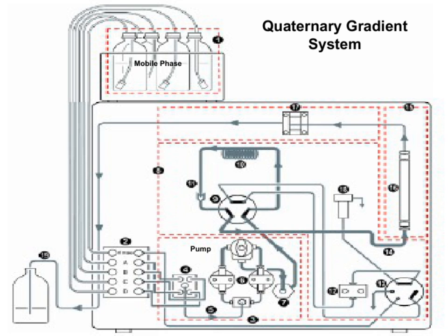Putting it all together, these components, the pump, mobile phase, and gradient system, are interconnected. The pump delivers the mobile phase under controlled conditions, and the gradient system enables us to modify the solvent composition dynamically. Understanding how these elements work together helps us achieve accurate, high-resolution separations, which is at the heart of our overall analytical goals.